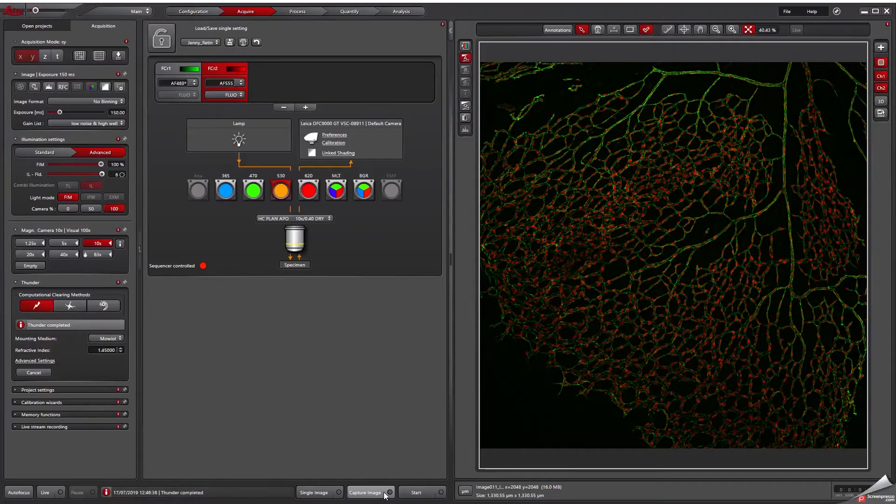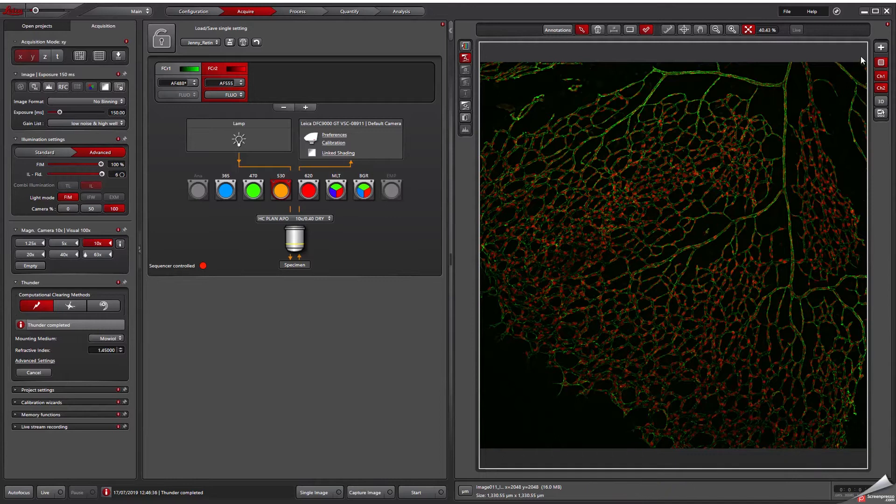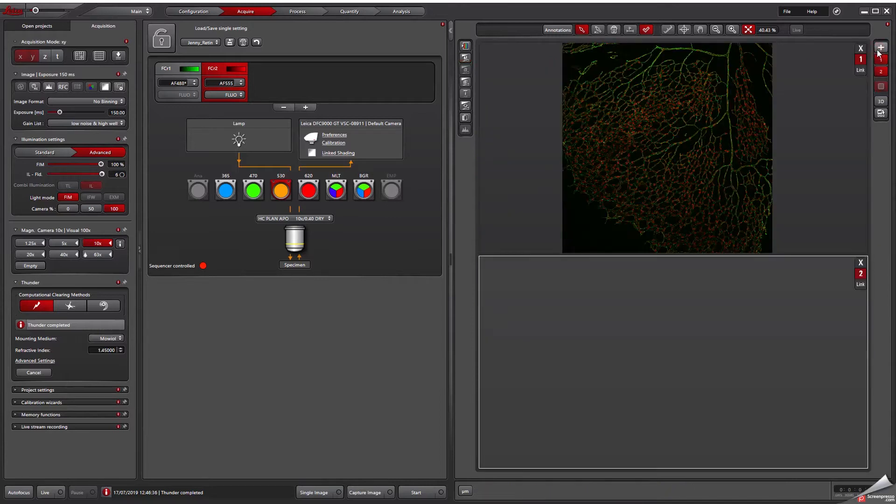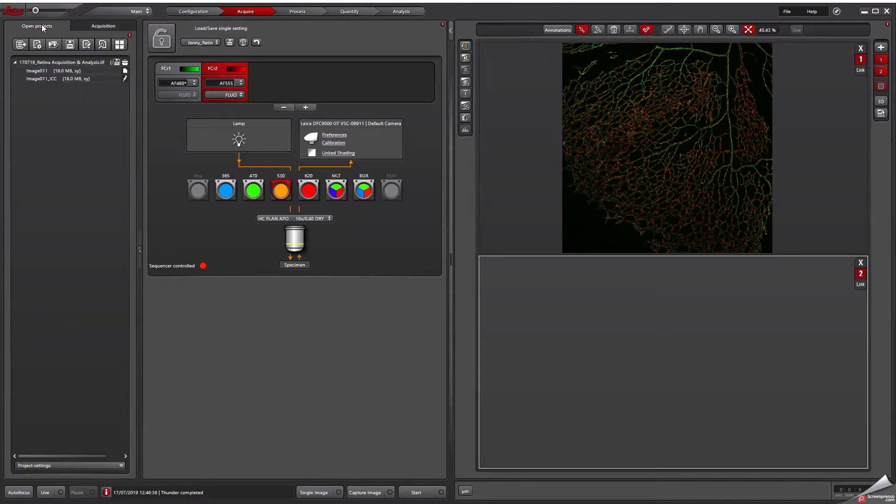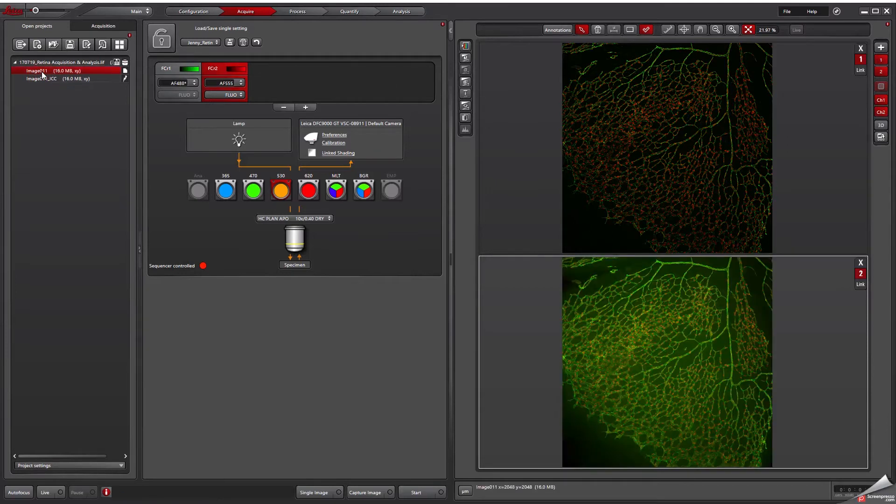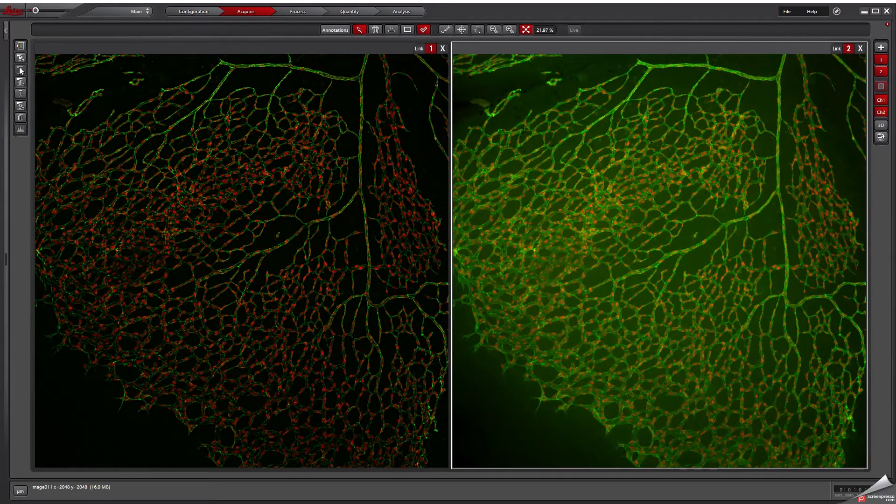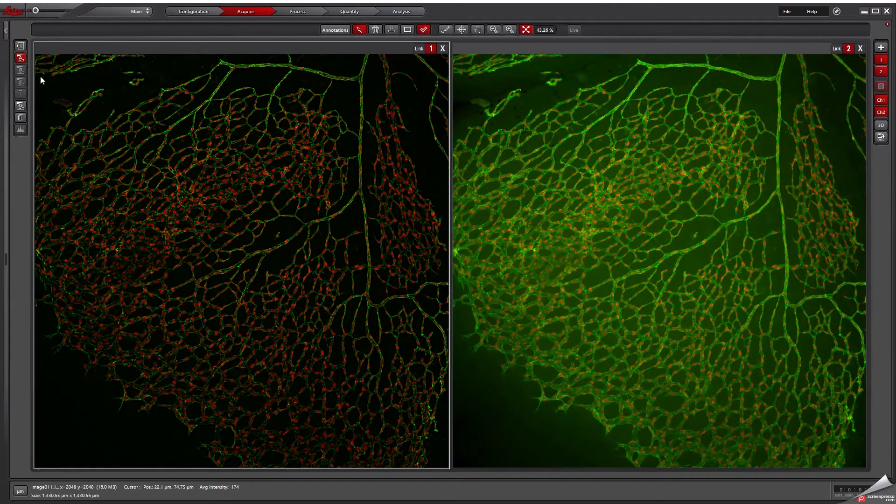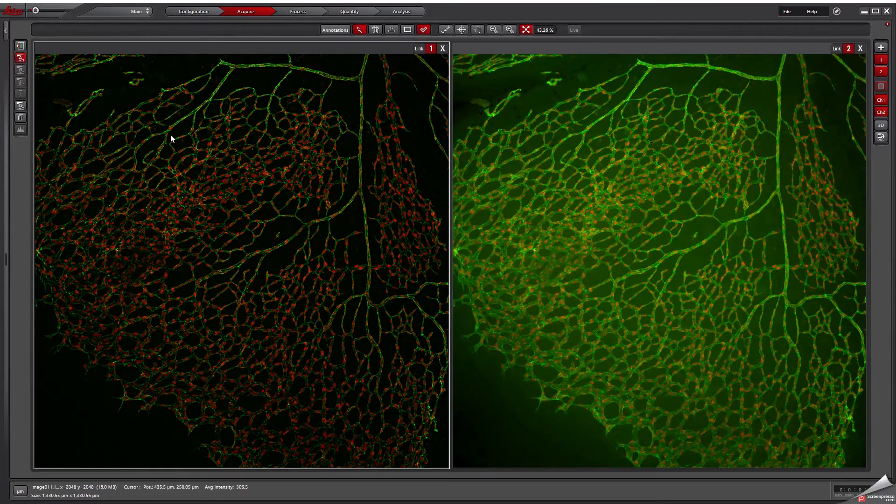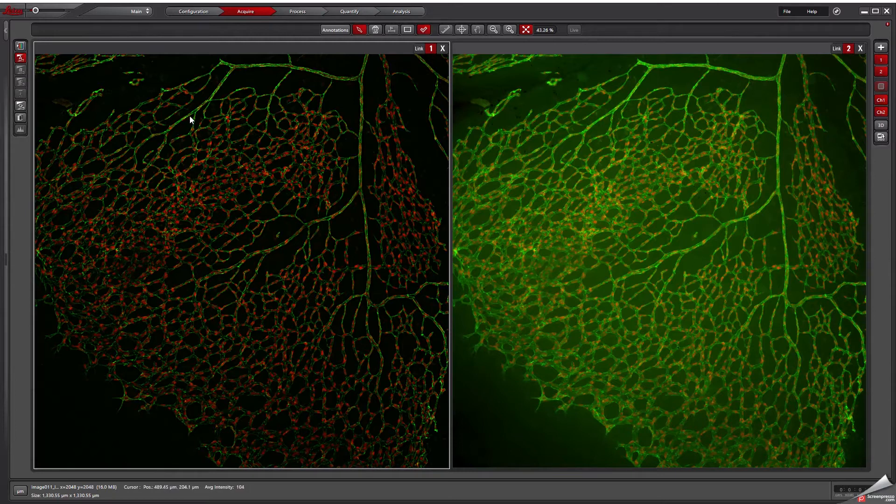The beauty is that you always keep your original wide-field data. A side-by-side comparison of the Thunder and classical wide-field image nicely demonstrates that Thunder already works on a single plane. So you receive a crystal clear image which reveals a nice vessel structure.